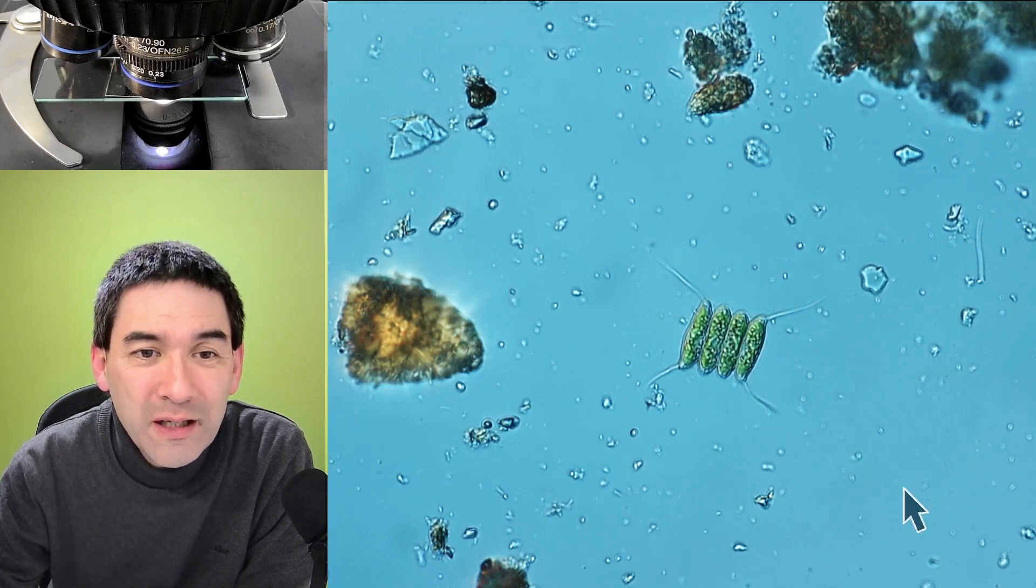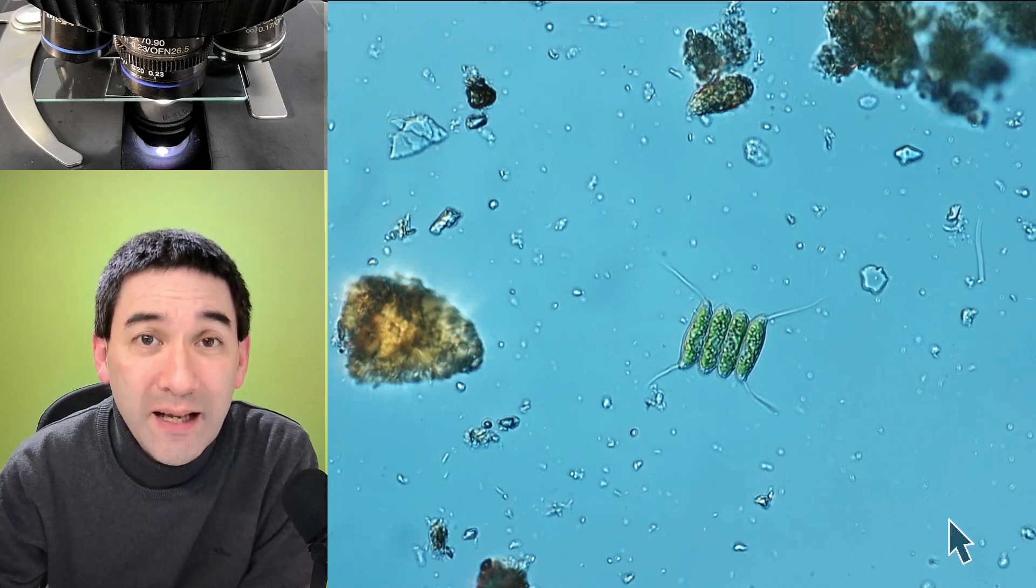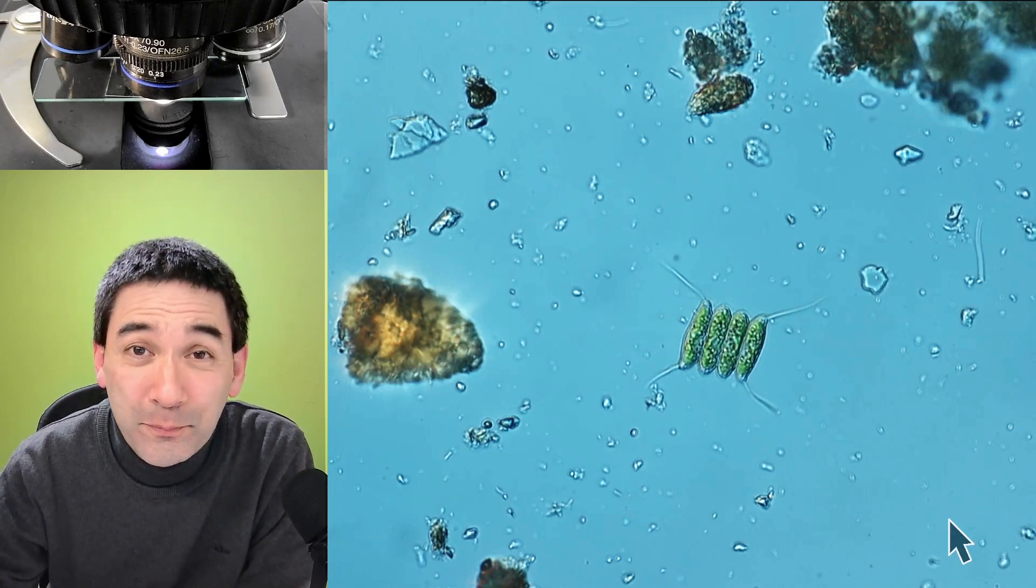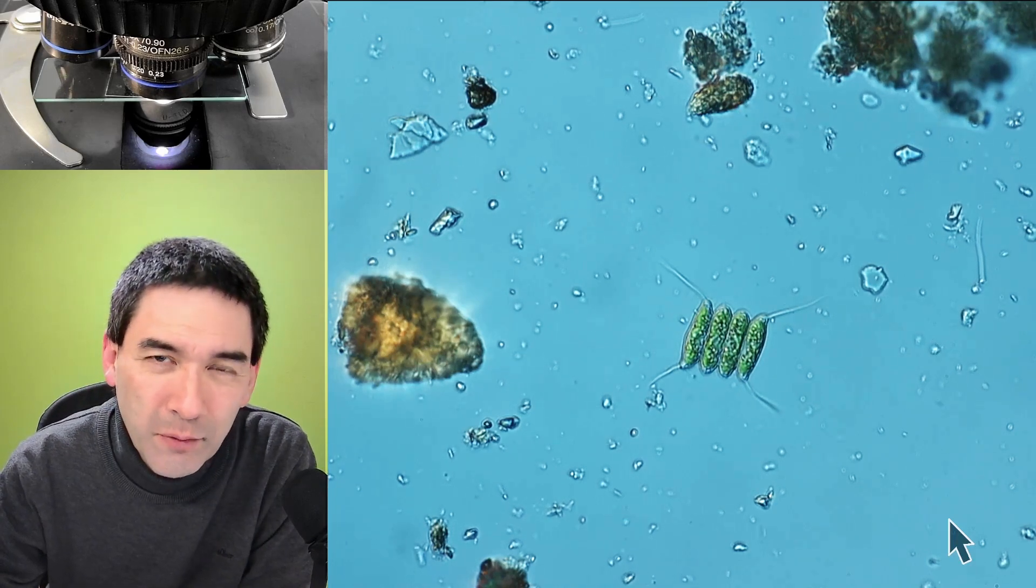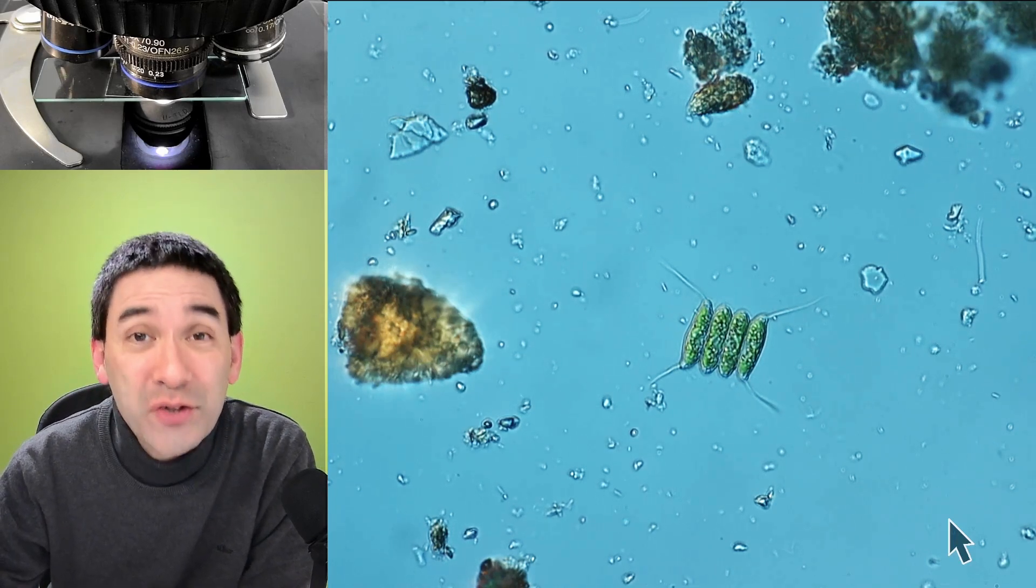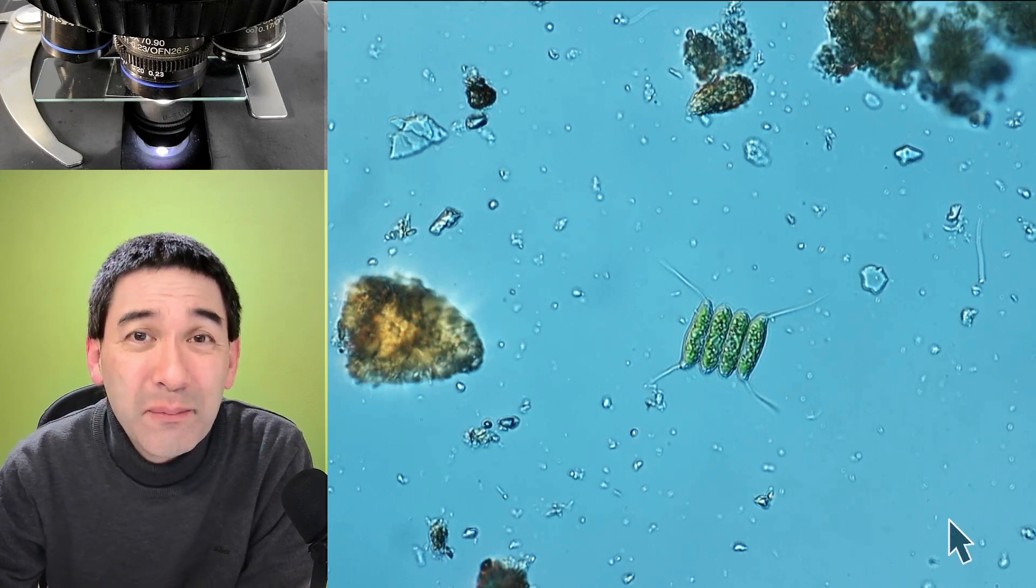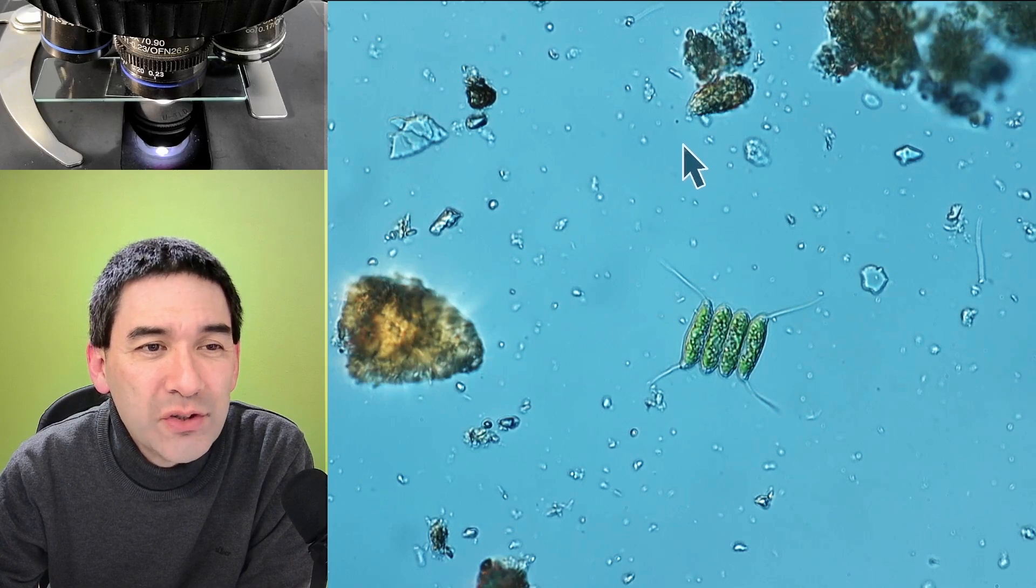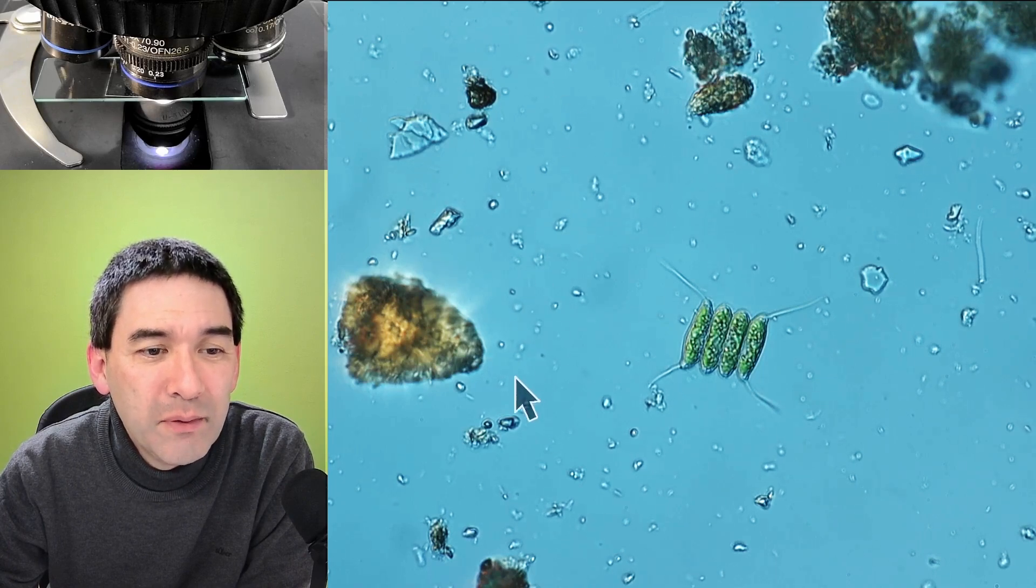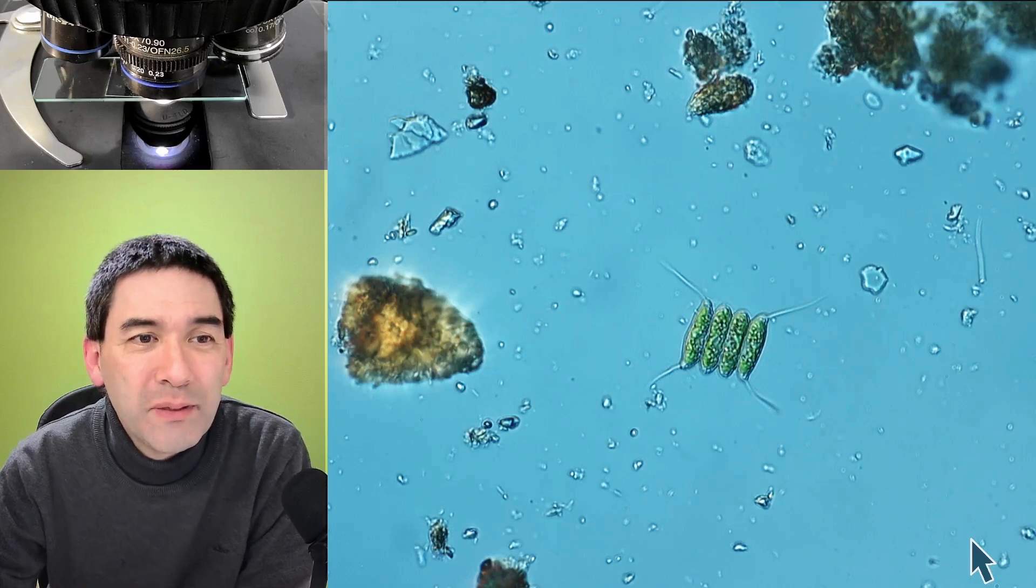So what is the summary? Besides those green algae, several diatoms, diatom shells of course, and a couple of ciliates at least. I found also a nematode worm which was kind of hiding behind some debris and here in the background if you look carefully you see those tiny dots that are moving. In many cases these are also bacteria, so there are also plenty of bacteria in the sand sample here.